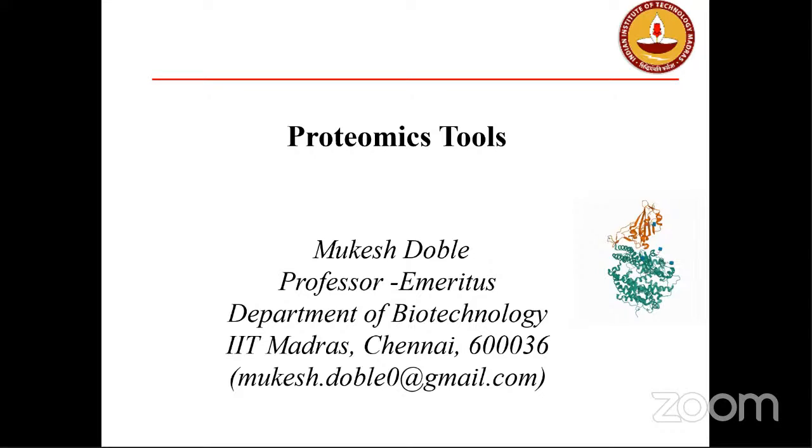I'm going to talk about proteomics tools. So there are several tools which have really propelled proteomics to a higher level. So the tools and the proteomics research went hand in hand, and that is why there is a lot of development in proteomics. So we will cover some of those, and we'll also look at what are the problems in understanding proteomics, what are the problems in getting the sequence and structure of a protein.